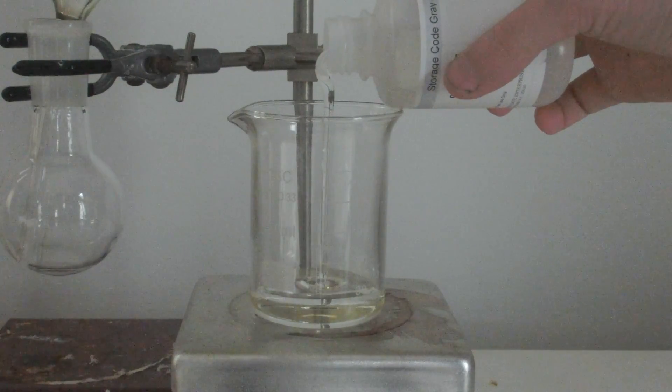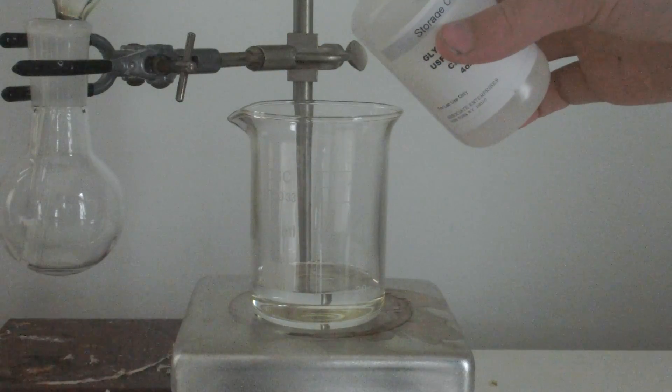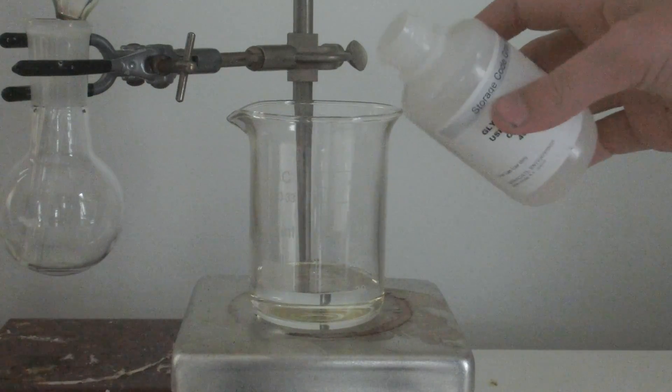First, measure out 30 milliliters of glycerin into a beaker on a hot plate. Then turn on the hot plate to high heat to drive off all of the water.